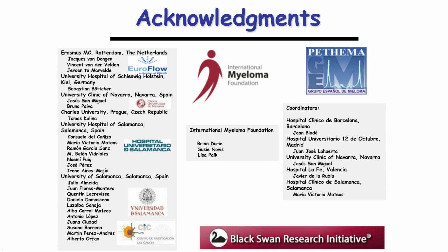For example, here we have beta-2 microglobulin, which we have just mentioned, and we have another marker like CD28 that is also associated with, abnormally expressed in, myeloma cells and contributes to a better discrimination of the abnormal cells.